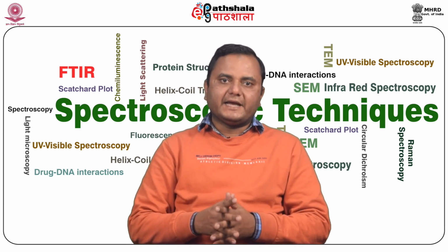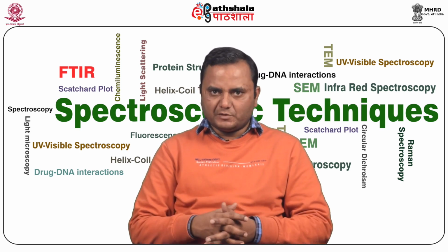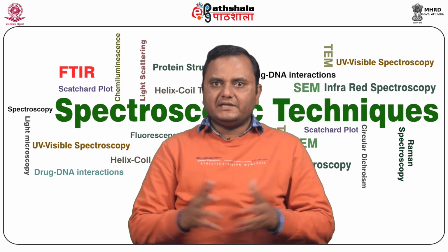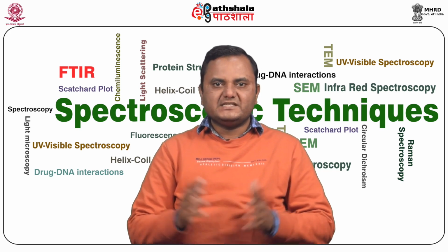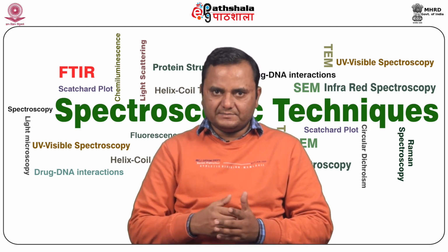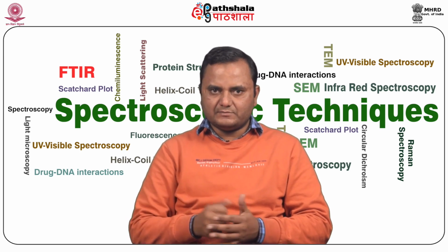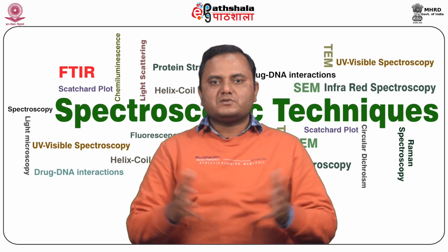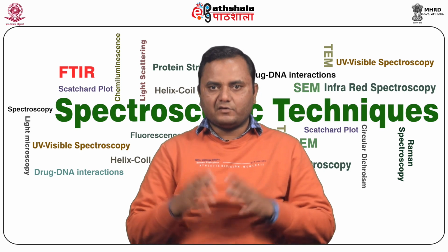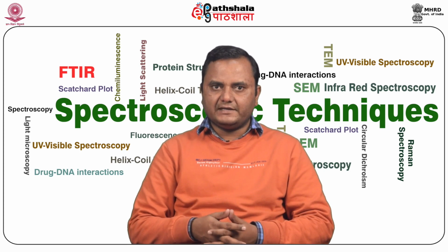Generally, all optically active compounds exhibit CD in the region of appropriate absorption bands. So an optically inactive molecule does not show any CD. CD is measured as a quantity called mean residual ellipticity, and its unit is degree centimeter square per decimole. The absence of regular structure results in zero CD intensity, while an ordered structure results in a spectrum which can contain both positive and negative signals.